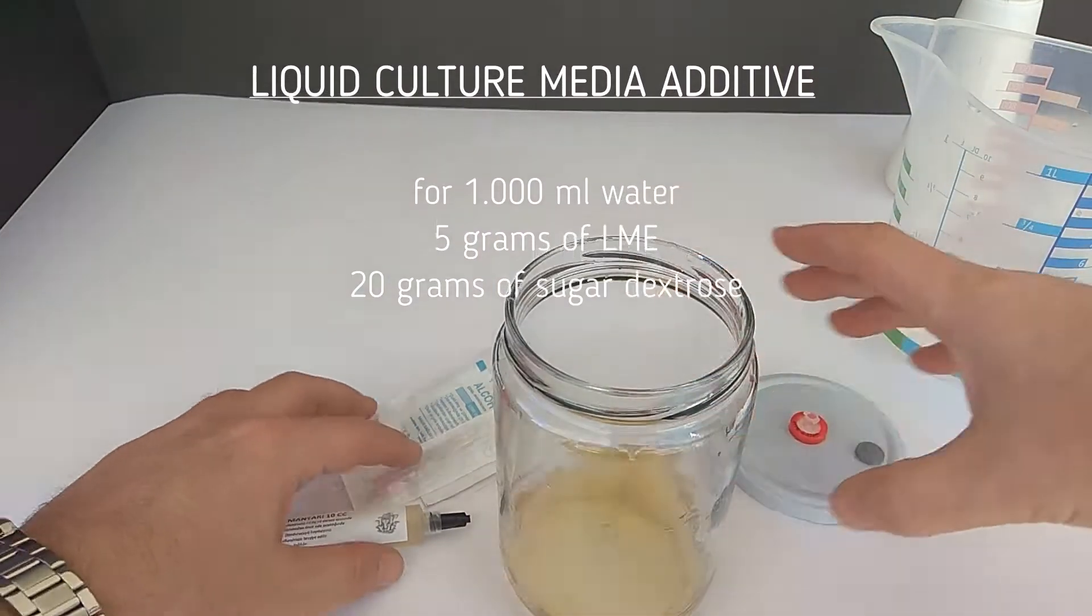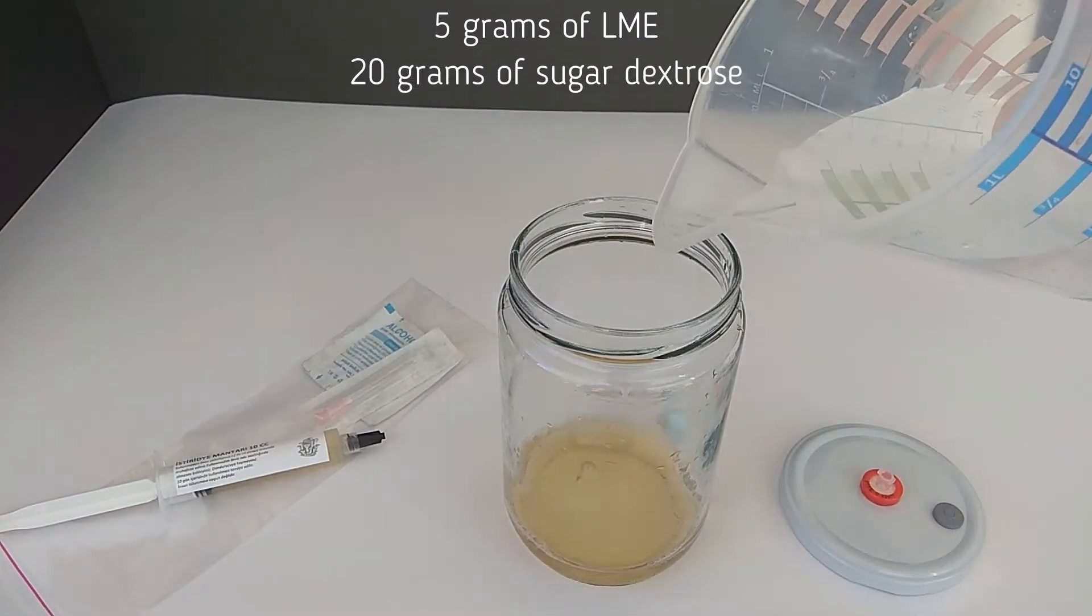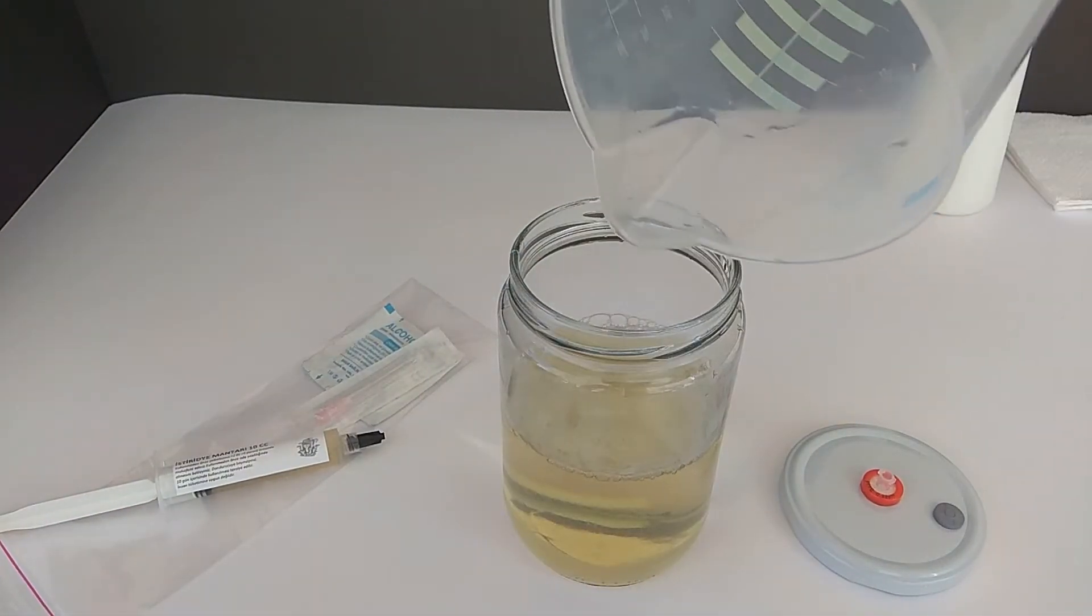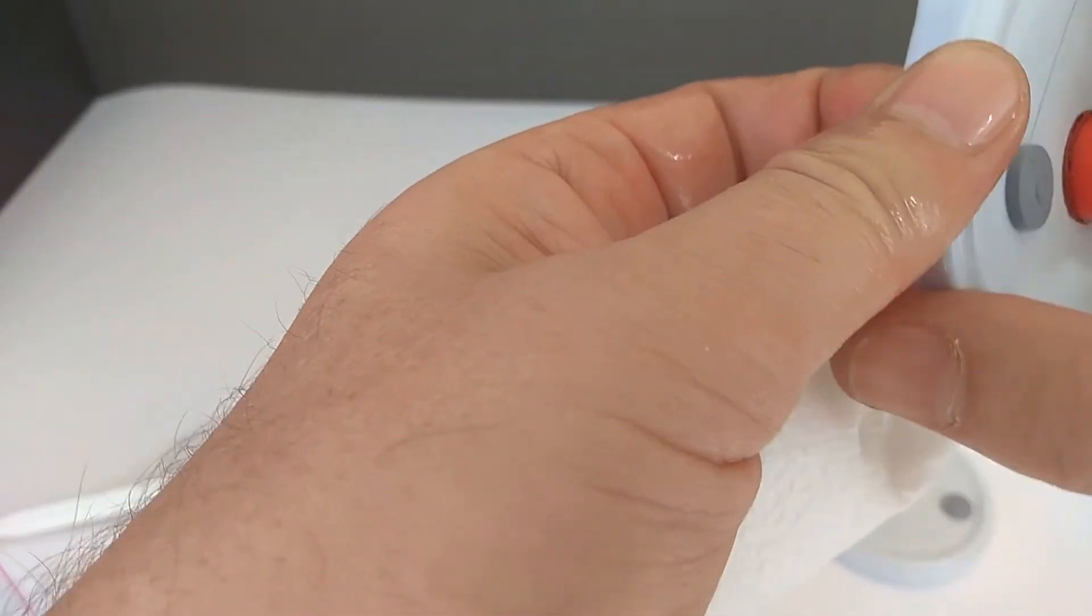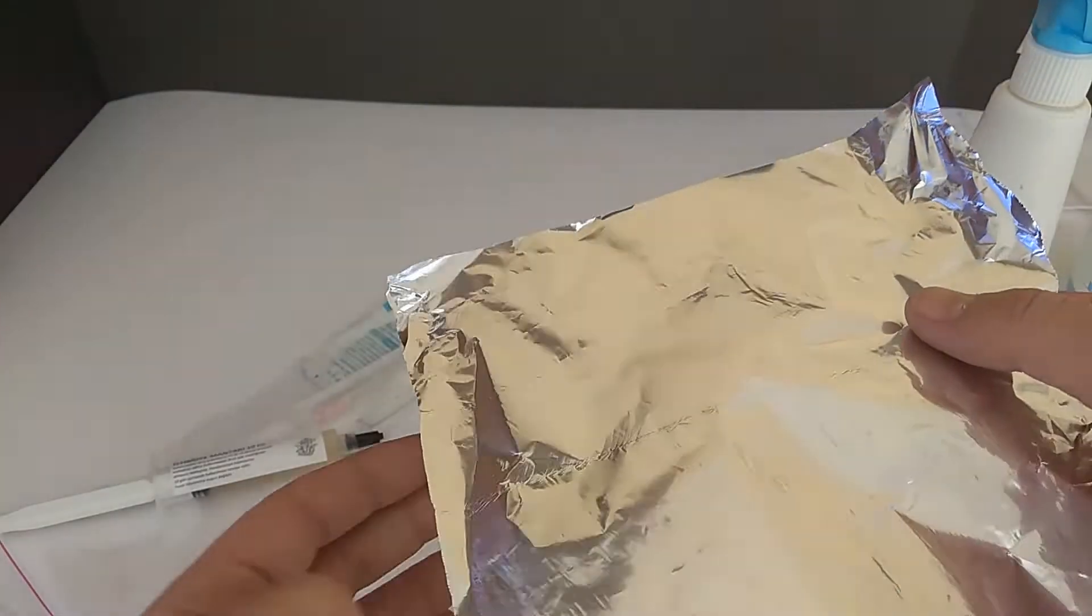We put the magnetic stirrer in your jar and pour 300ml of hot water. We thoroughly wipe the inside of our lid with an alcohol cleaning wipe and close the lid. We need to cover it with aluminum foil so that water does not come to the filter of our lid.